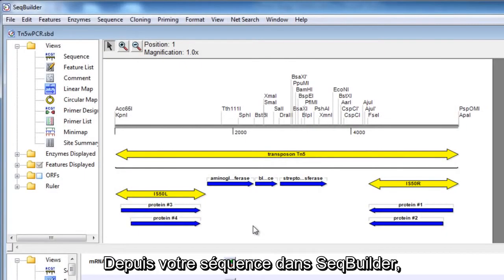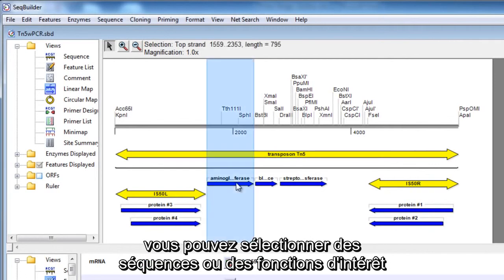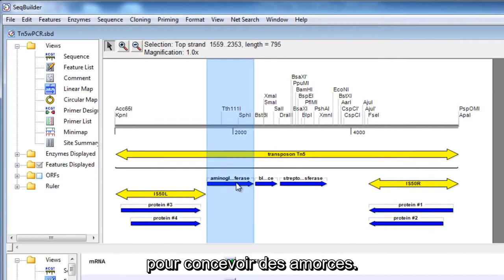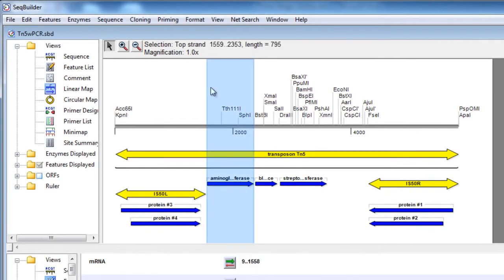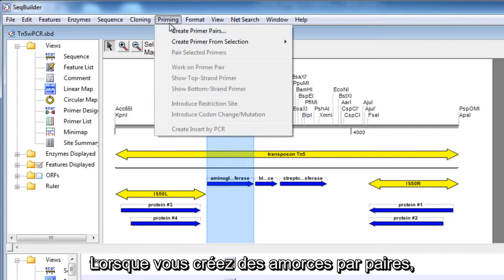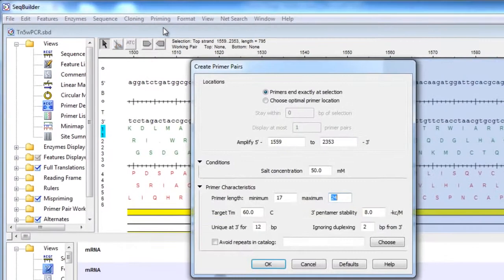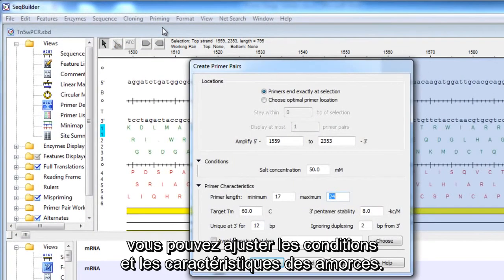From your sequence in SeqBuilder, you can select sequences or features of interest to design primers. When creating primer pairs, you can adjust conditions and primer characteristics.